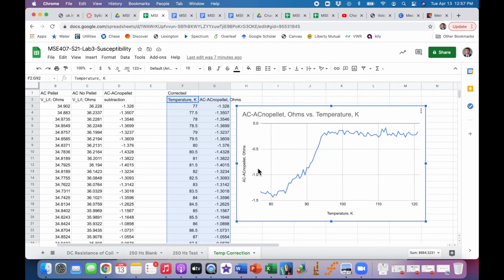And so you can fit a line to that. You can draw a line in here and get a better fit. But I'm just going to go to 0.8 and show you what that might look like. And so it's somewhere right here. And you can see that this is the closest one I can find to negative 0.8, so halfway in between, and we have a temperature of 91. So for this analysis, our critical temperature is approximately 91. You can get a better, more consistent fit by fitting these regions, but I'm just going to take 91 to be our critical temperature for this demonstration.